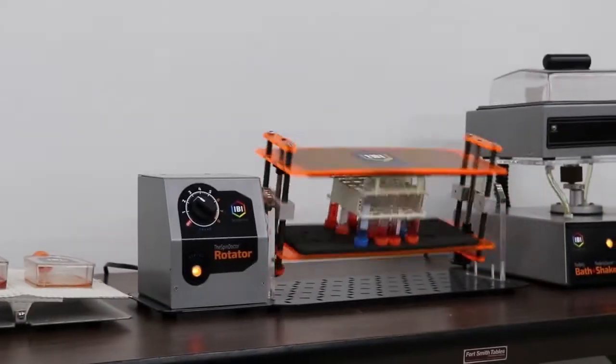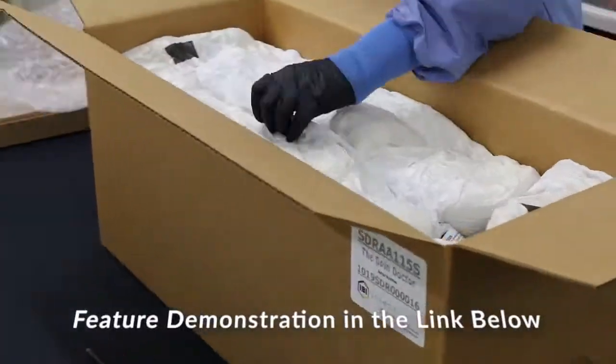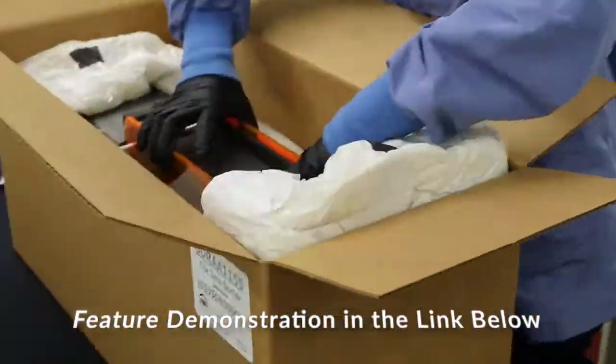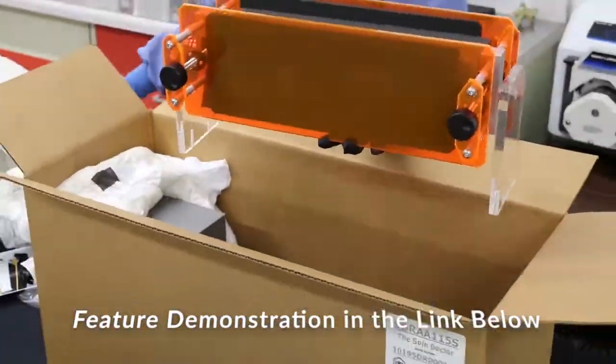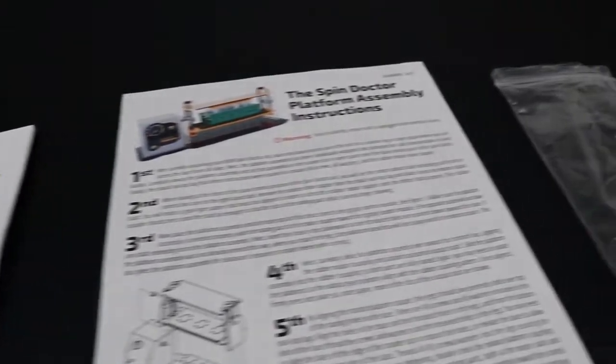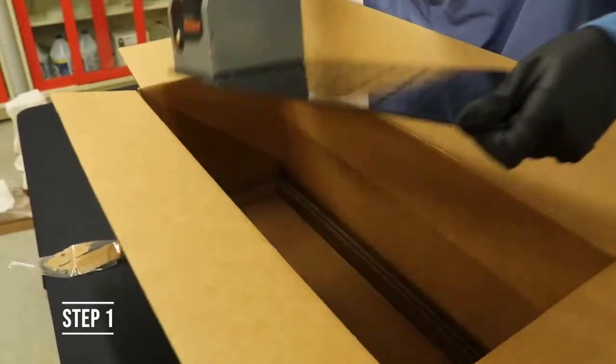In this video, we will show you how to assemble your new tube rotator in just 5 easy steps. If you want to see the operational features of this product, check out our other Spin Dr. videos in our YouTube library. Please notice there are written instructions that you can follow along with, but don't be afraid to pause this video as we have sped up some of the motions.